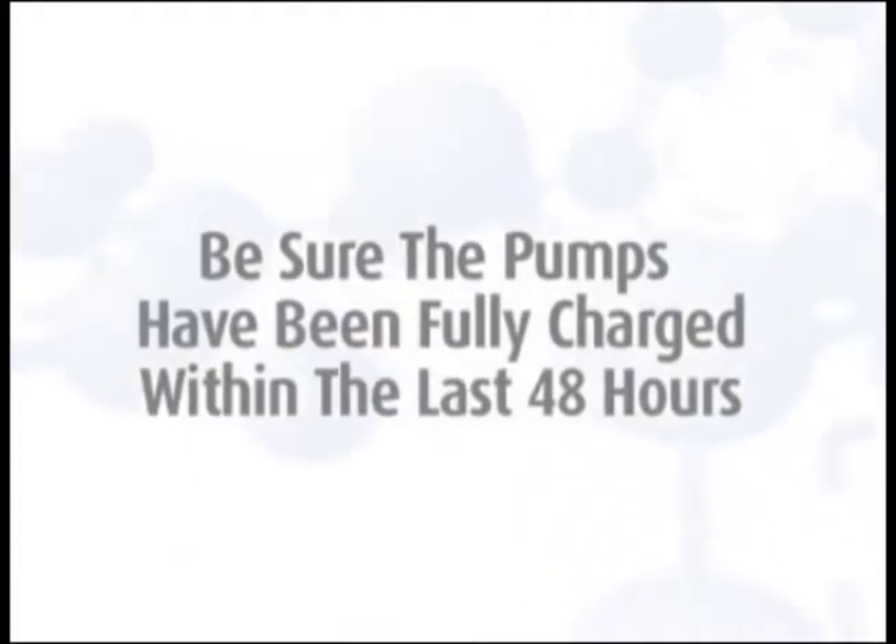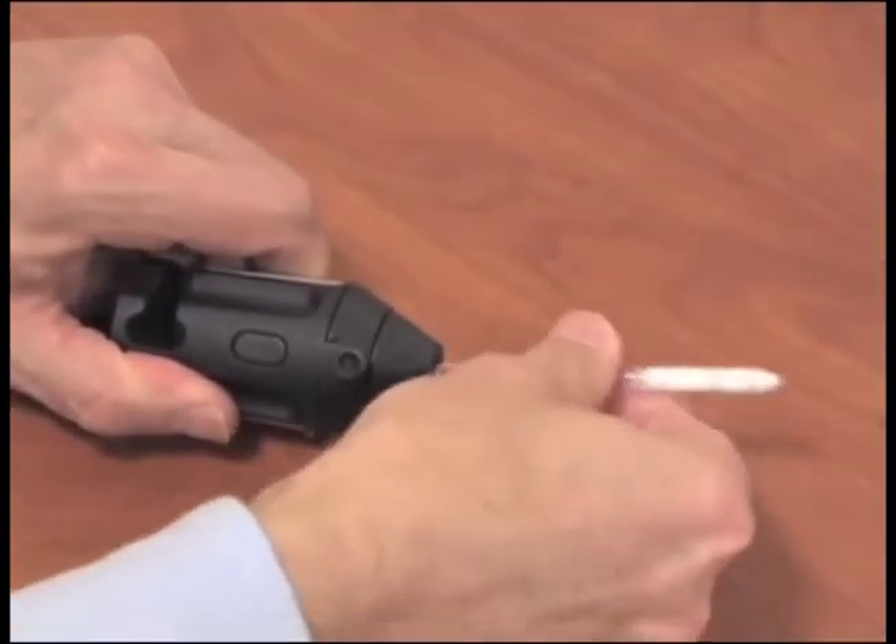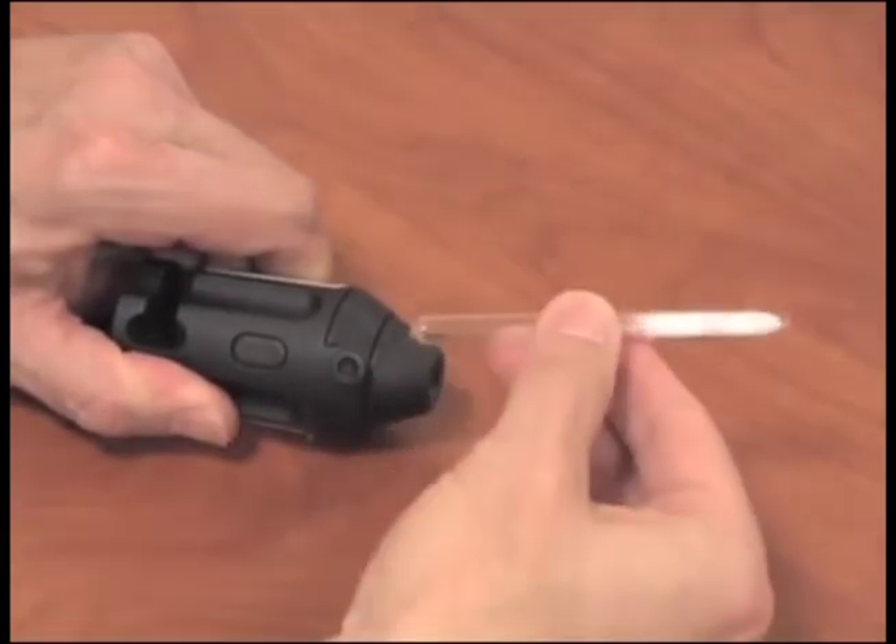To begin sampling, be sure that pumps have been fully charged within the last 48 hours. Use a tube breaker to break both ends of the tube marked Orbo 43 to provide an opening at least one-half the internal diameter.